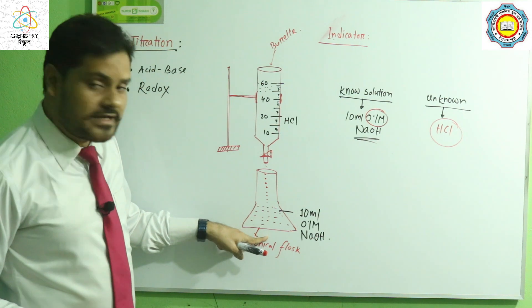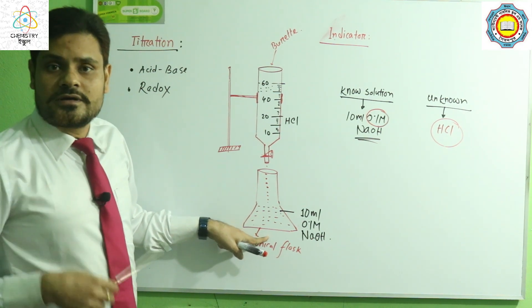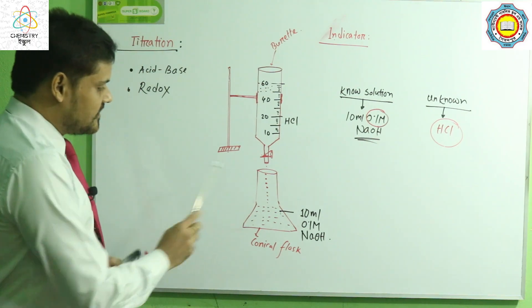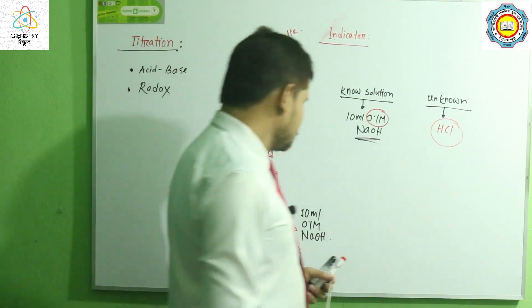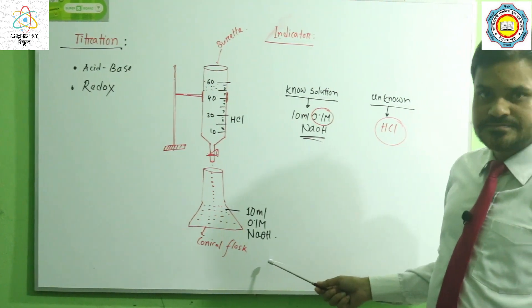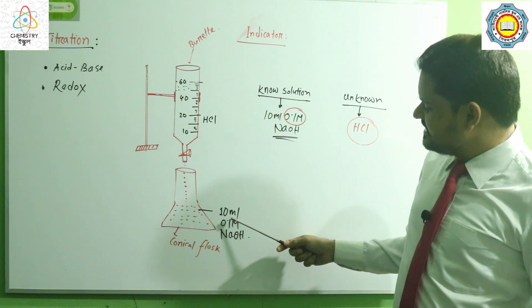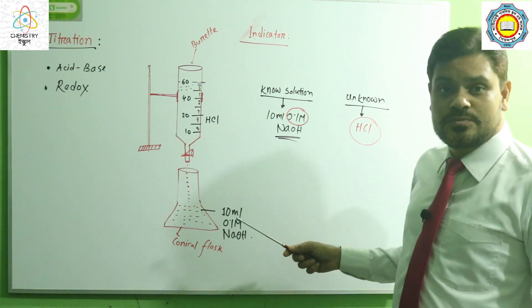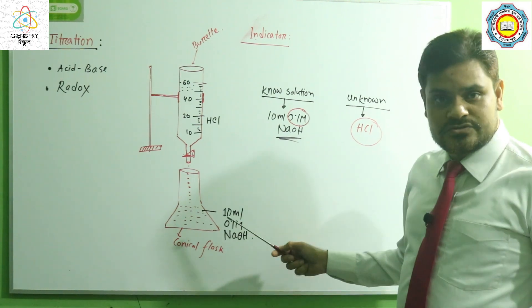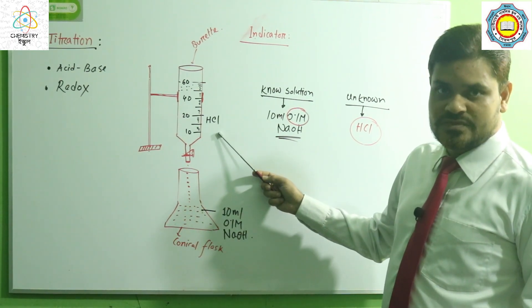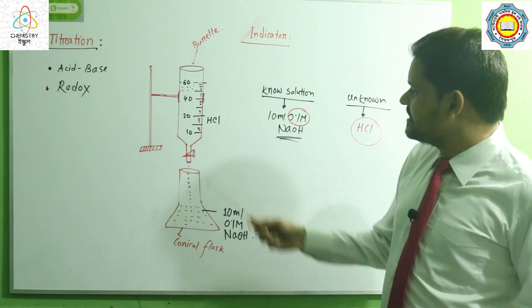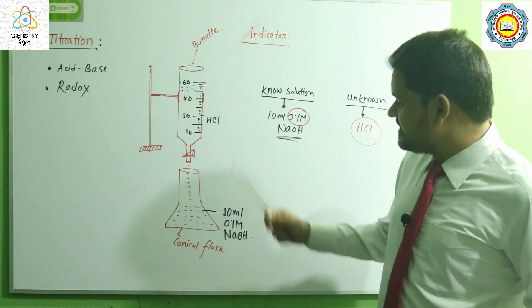The burette contains the HCl solution. When we rotate this stopcock or screw, the solution from the burette comes out into another glass apparatus called the conical flask. Here in the conical flask, we contain 10 milliliter of 0.1 molar sodium hydroxide — this is the known solution — and the HCl is the unknown solution. We use a stand here to keep the burette.